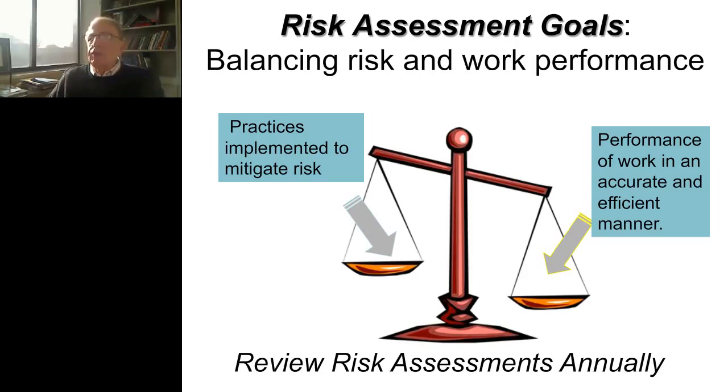Now, as we do risk assessments, with this goal being the balancing, we also have to remember changes occur, and we should review our risk assessments at least annually. And we'll talk about reviewing them when other changes occur in our lab as well. But at least annually is a good thing to remember.